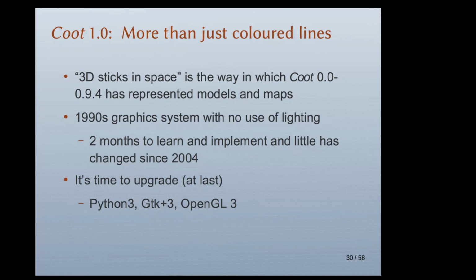Every pixel has to be rewritten from scratch. I had no knowledge of making graphics work with modern graphics infrastructure or graphics library infrastructure and how it works with the hardware. So I had to go back to school and, as it were, go to Graphics Programming 101. And it turns out that every single tutorial and book dedicated to OpenGL presumes that the developer is trying to program a game. So in order to learn what it was that these tutorials are trying to teach me, I've been infused with game developer thinking, as you'll see.